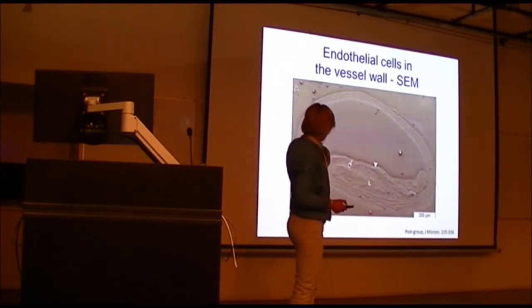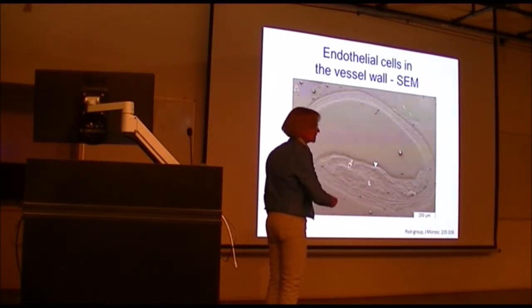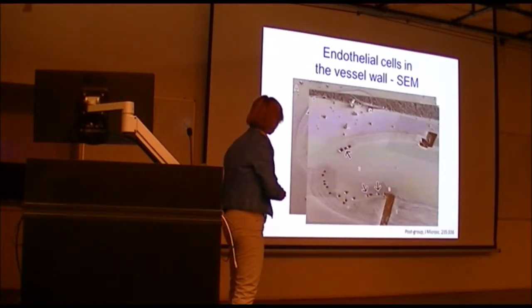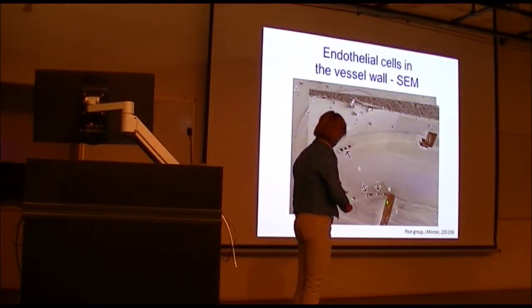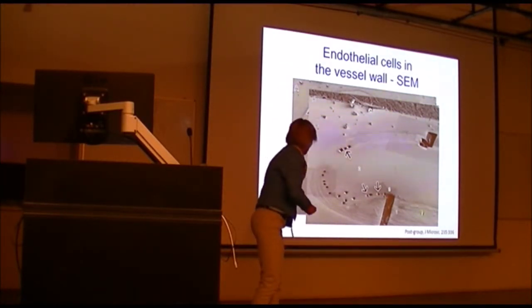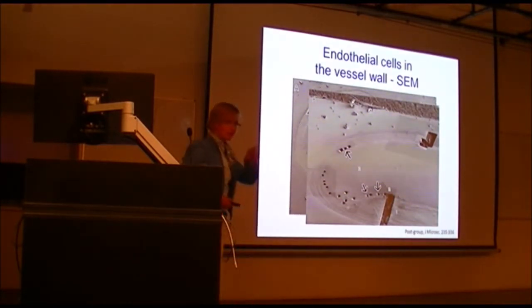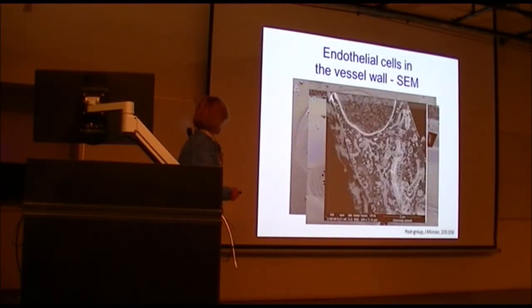scanning, and you can already recognize, because now you're already trained, that this is a vessel. See, here we have a line. And here we have a fatty streak over here. You see this just with this scanner. And now the exciting thing of this new technique is that you can start digging holes in certain spots in this vessel wall. Actually, this is a healthy part. This is a part where there is loads of fat accumulation, and this is the transition part. And you can study these 3 spots very selectively.